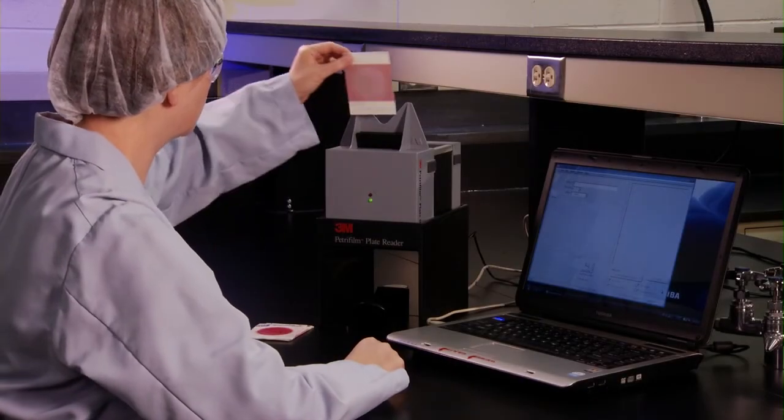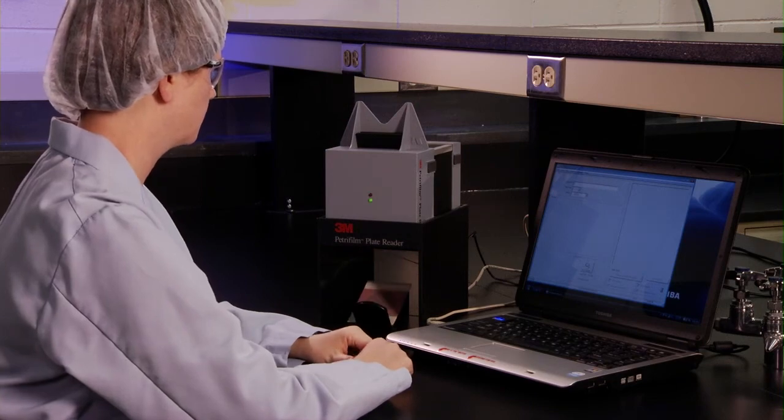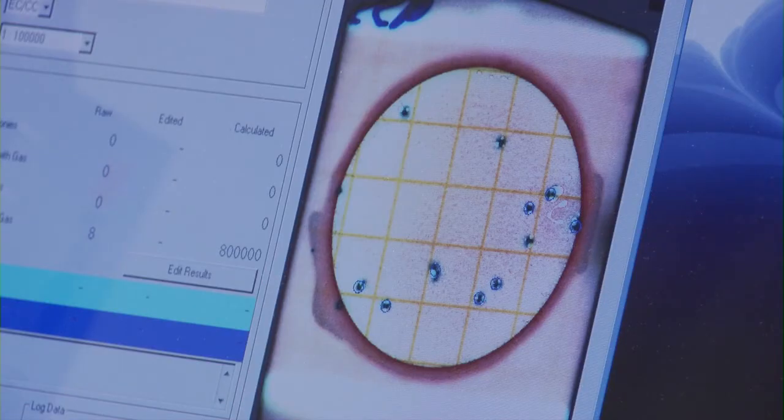3M Food Safety also provides an automated 3M PetriFilm plate reader, which provides for more consistency and reliability in counting and data management.